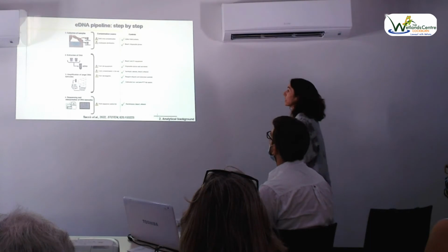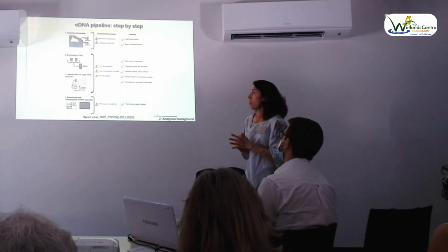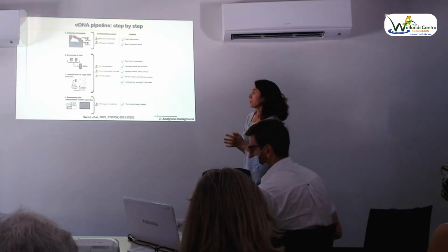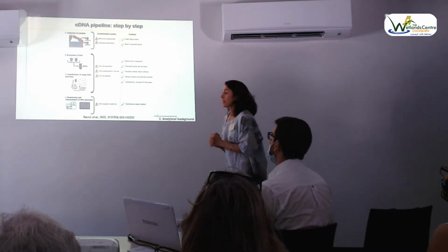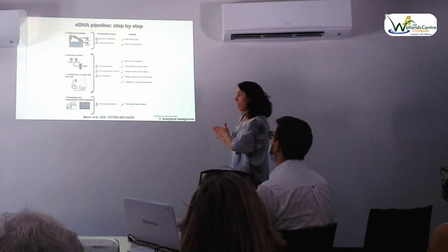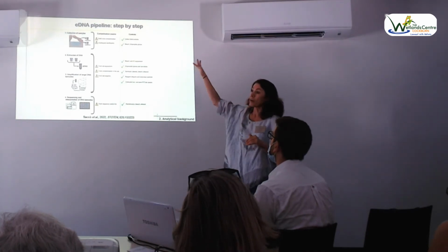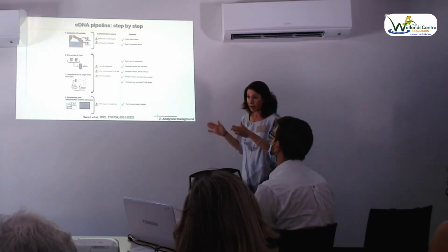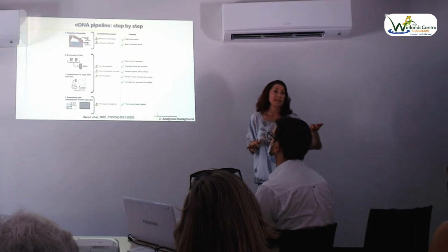Now, something to be really conscious and careful of, and we are very aware of this in our lab because we've been doing this for quite some time, is sources of contamination. I really can't stress this enough, because contamination can come in at any point. Contamination sources start right in the field during sample collection, and that comes with sharing of equipment between different areas if you haven't properly decontaminated.